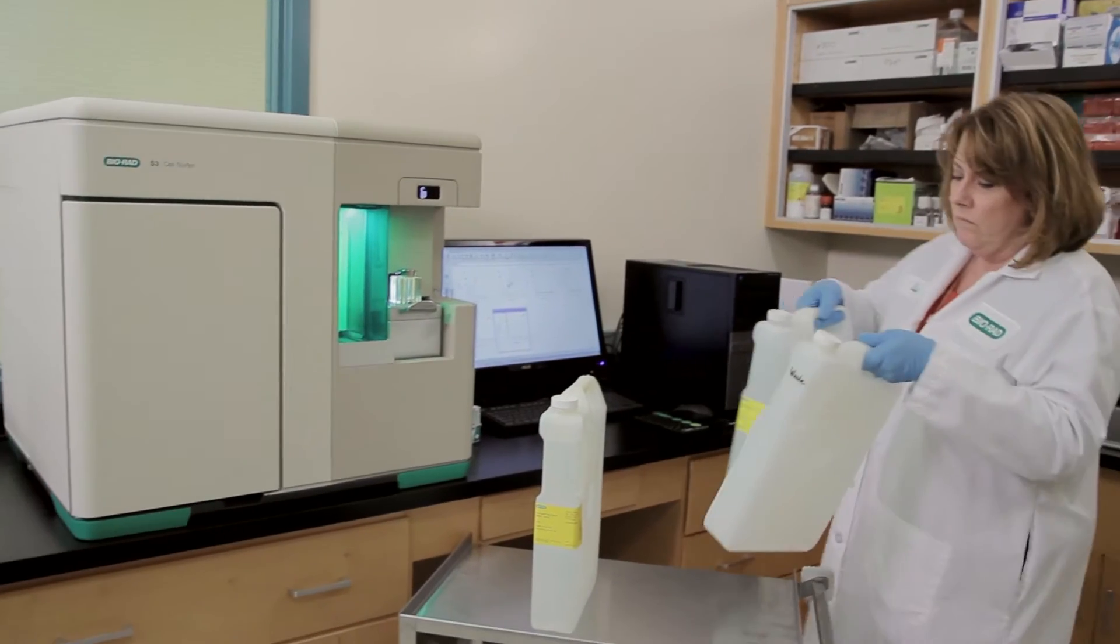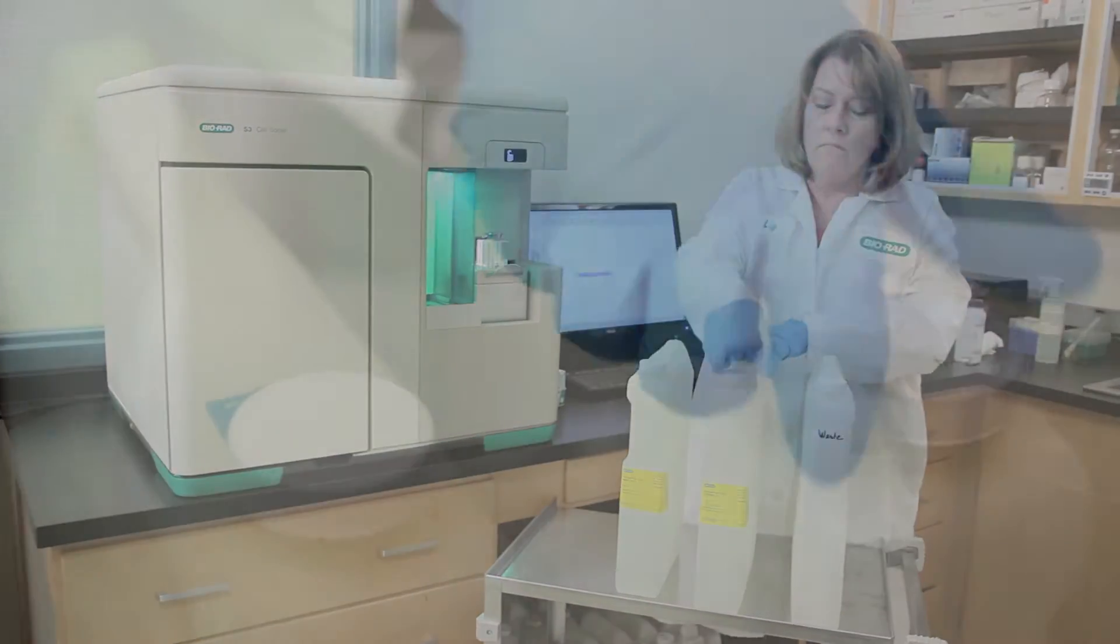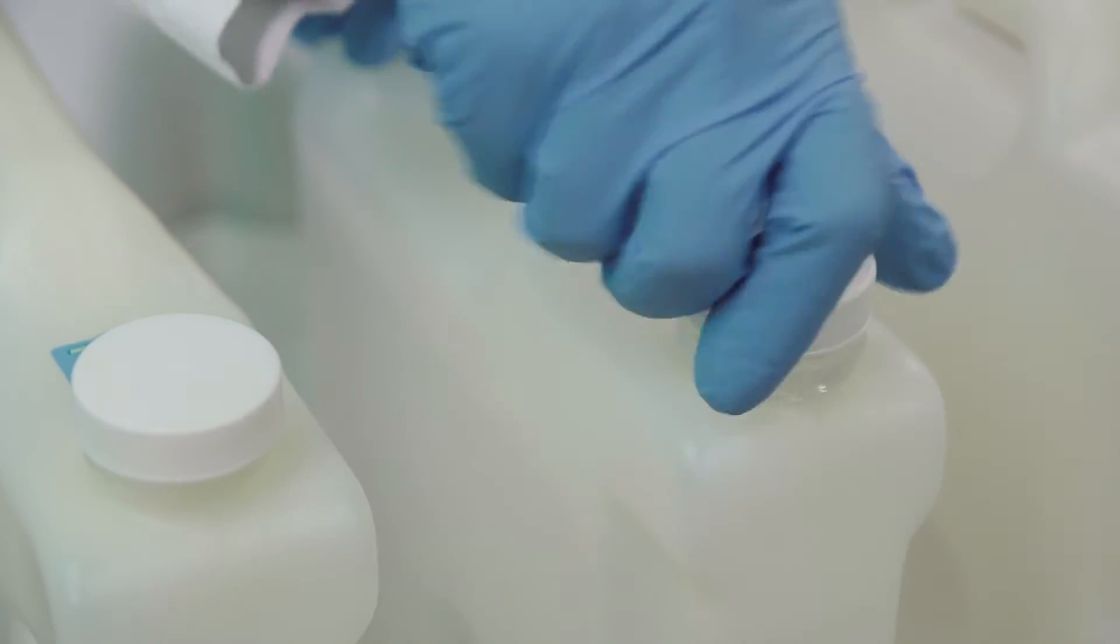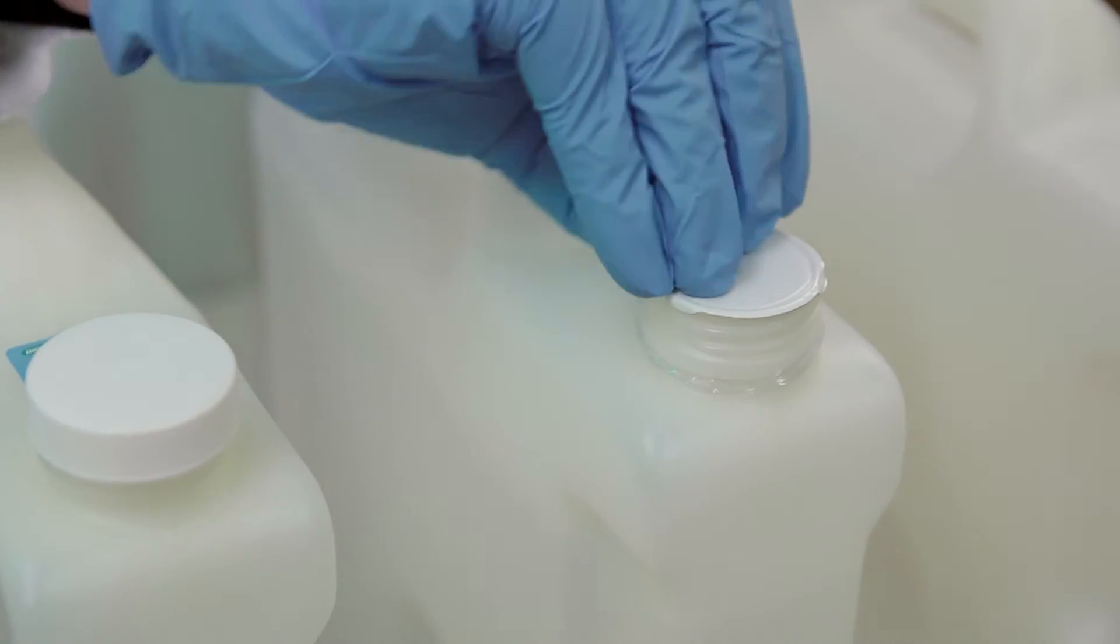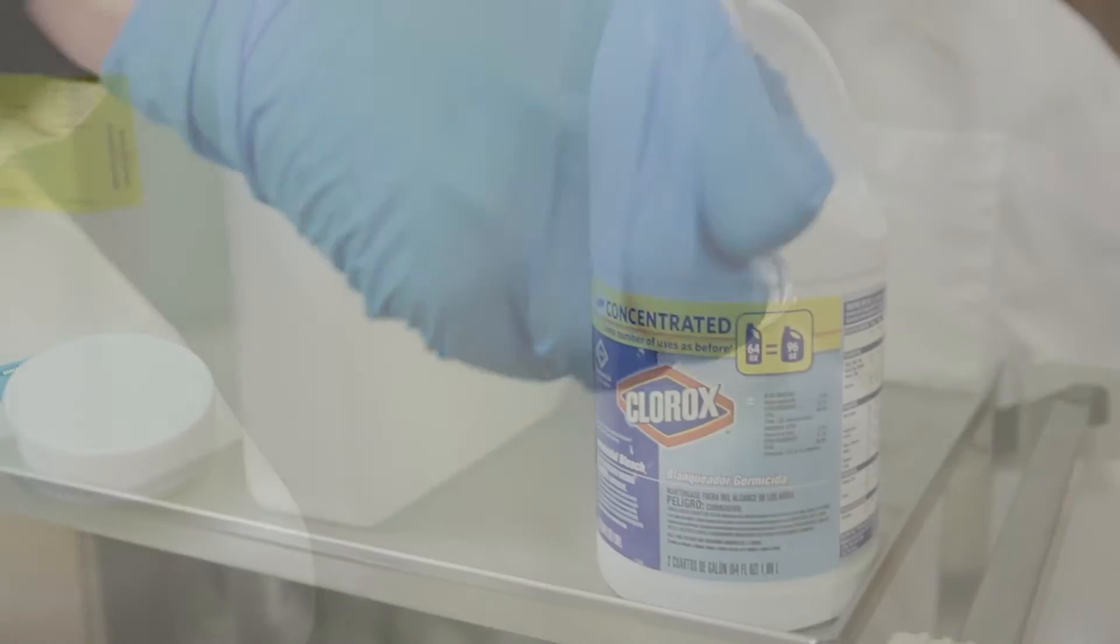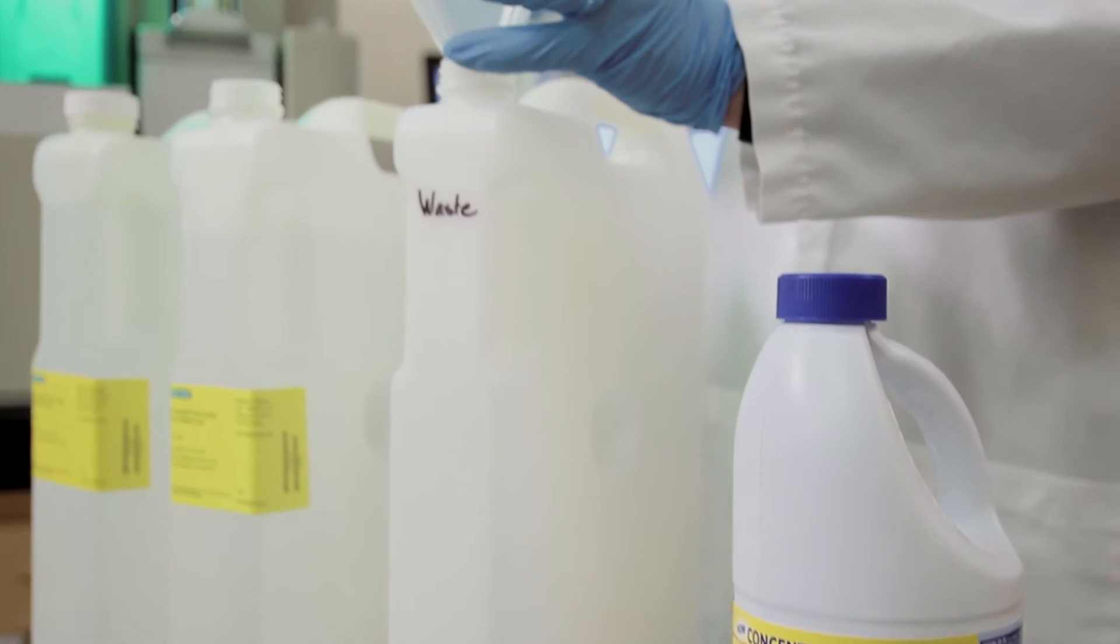To perform a hot swap, make sure you have the replacement bottles ready to go in front of the S3E. Remove the seals from under the caps of the new DI water and sheath fluid containers and prepare a waste bottle with 40 ml of bleach.